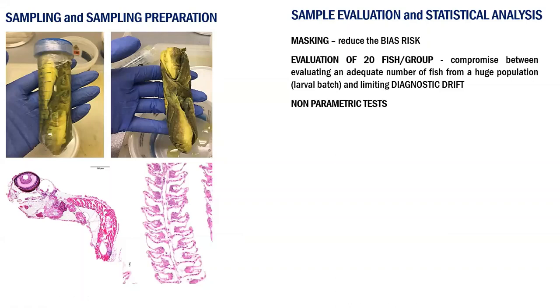The risk of having judgment subliminally influenced by information from the study belongs to the expert at every level. And so it's very important to start with blind observation of the samples. In this way, it's possible to reduce this risk.